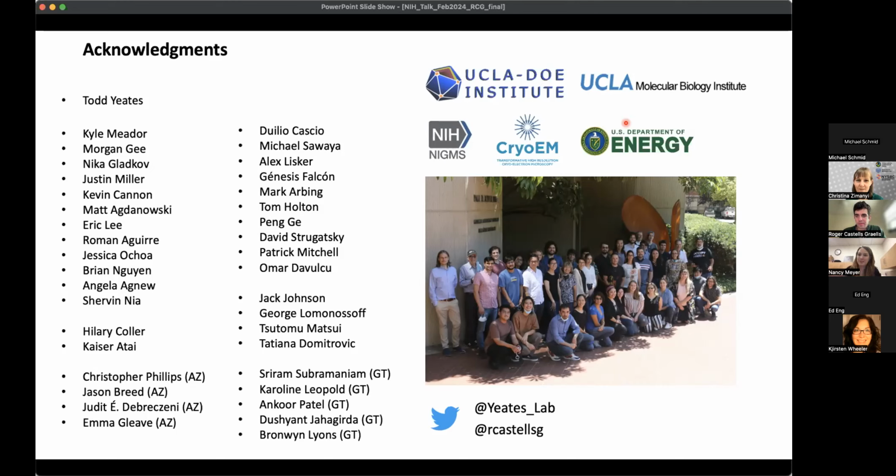Hi, this is Mike Schmid. As a shameless plug for other methods of looking at flexibility, you might try the Gaussian mixture model that was developed by Muyan Chen, who's now in our lab, that deals specifically with looking at the flexibility, including the flexible part and the stable part, rather than solid and rigid masks between them. It seems to work very well. And again, shameless plug, but it's something that you should look into.